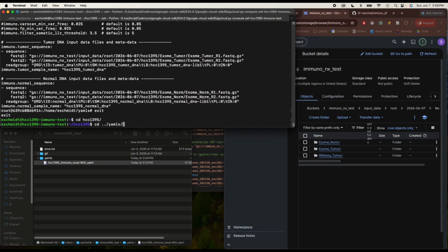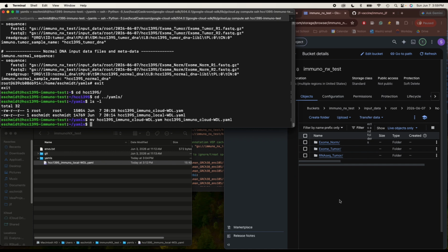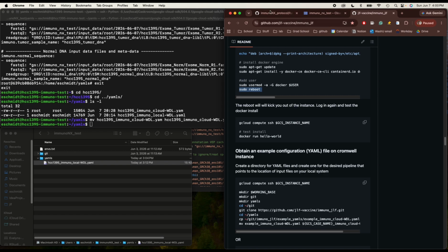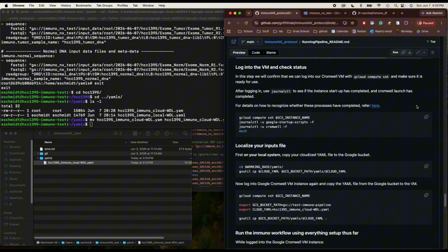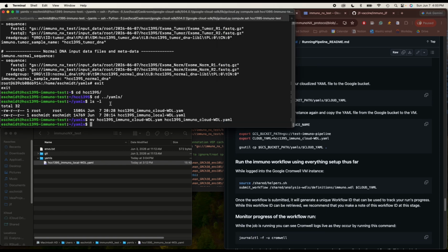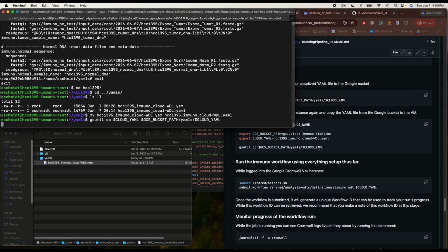So now we have our YAML, we have our VM. We can copy our cloud YAML to our bucket.